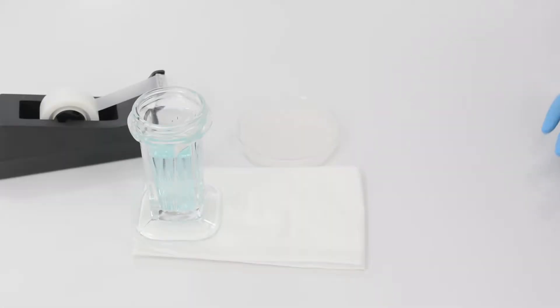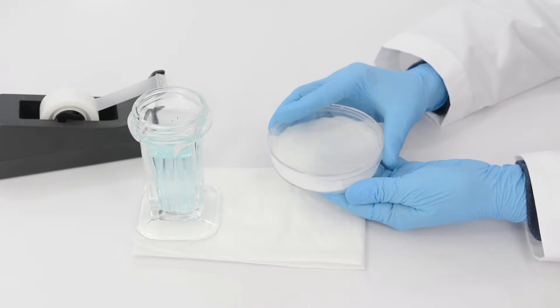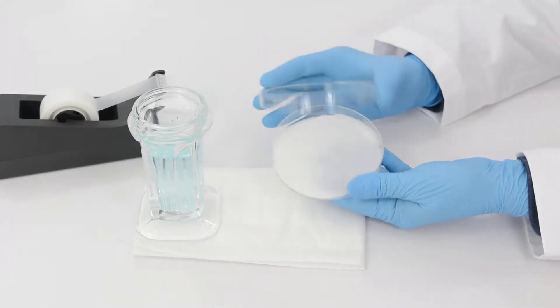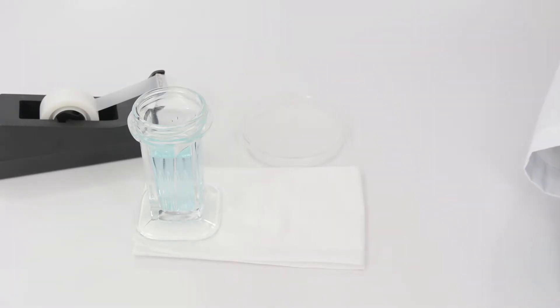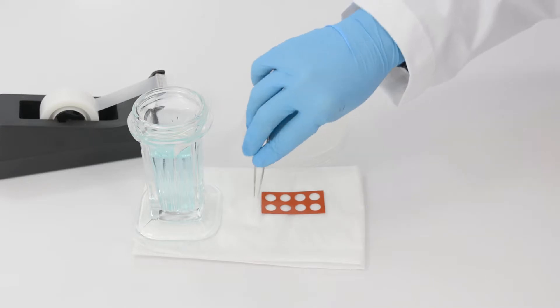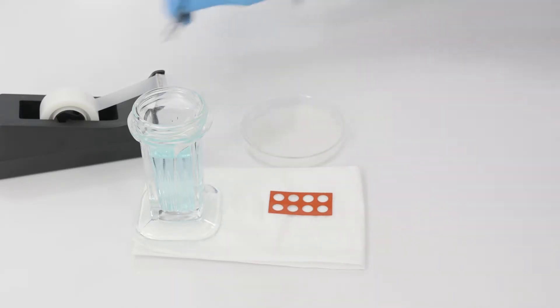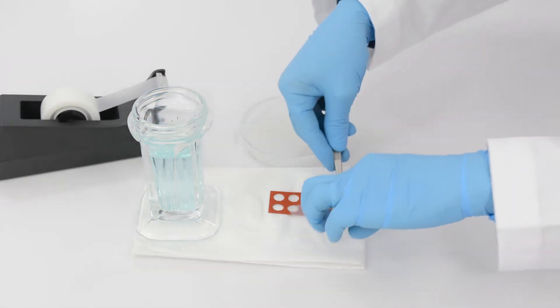Prior to applying silicon isolators to the glass, create a humidity chamber using moist filter paper in a lidded dish. Place the isolator on a non-stick surface. Use a piece of sticky tape to remove any dust particles from the silicon isolator.